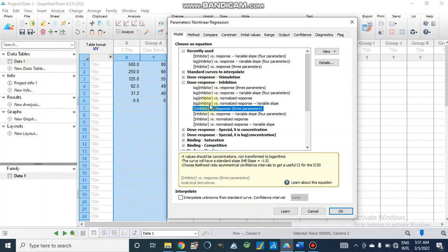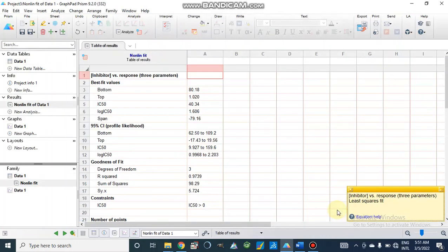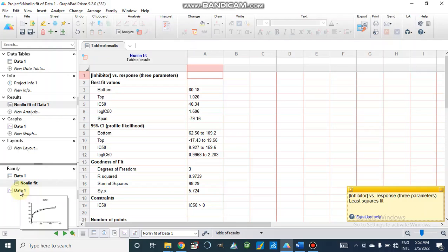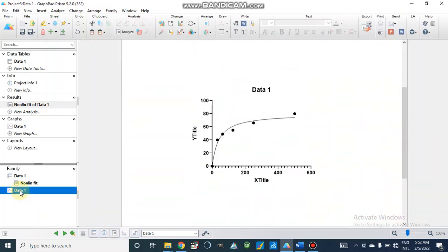Here we have only inhibitor concentrations and response, so I will select this one. Now here we get IC50 value which is 40.34 in micromolar, and we have degree of freedom is 3 and R-squared is 0.973.